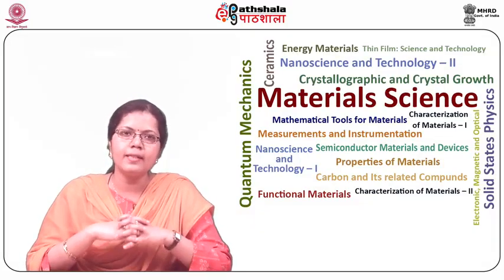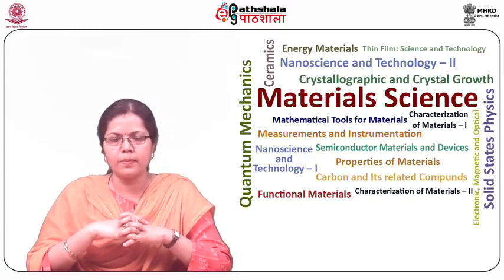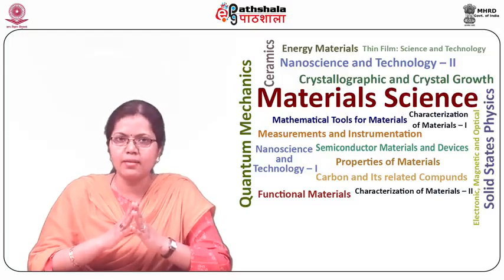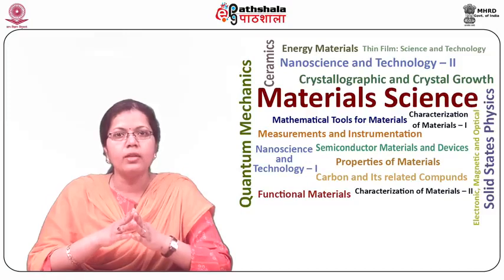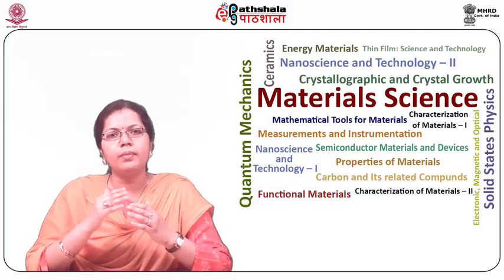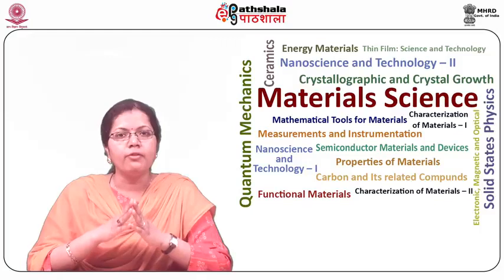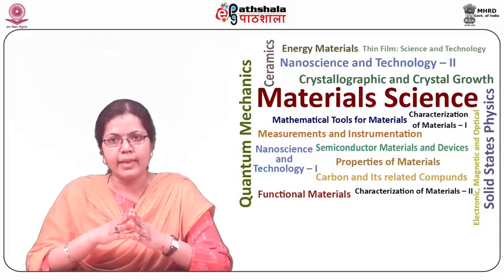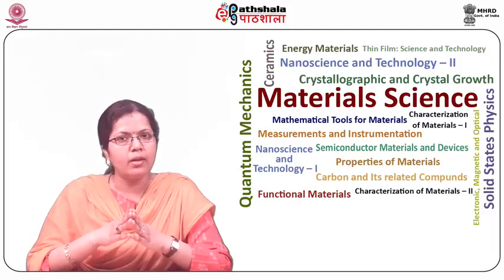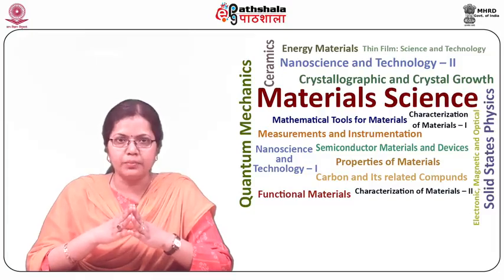Students, now let us understand the magnification of these microscopes. These microscopes achieve magnification by a two lens system, which comprises an ocular lens and an objective. The majority of bright field microscopes use three objective lenses which have variable magnification powers: 10x low power, 40x high power, and 100x which is oil immersion.